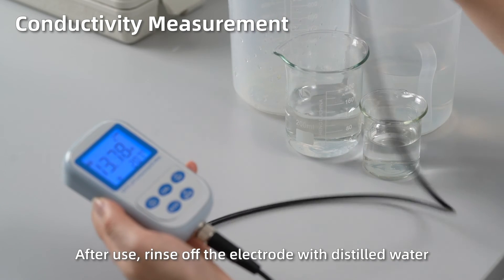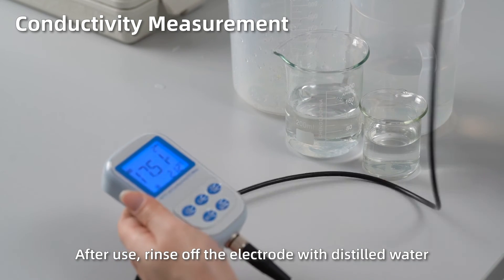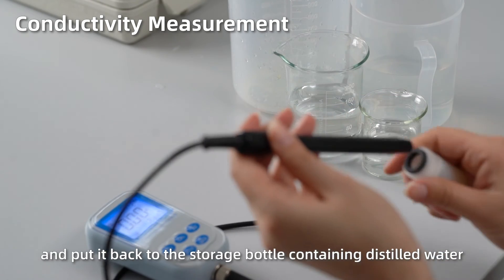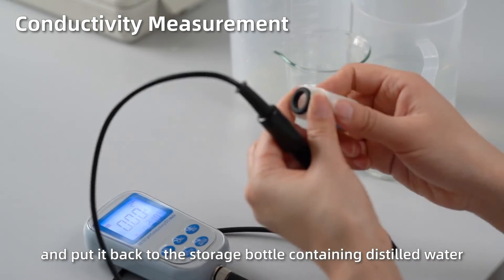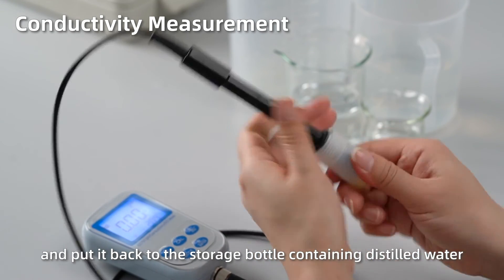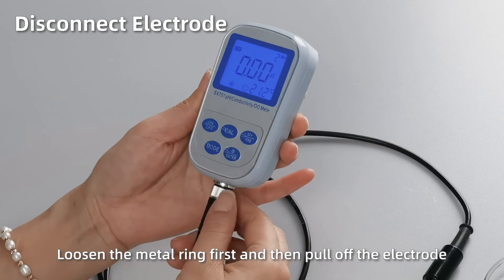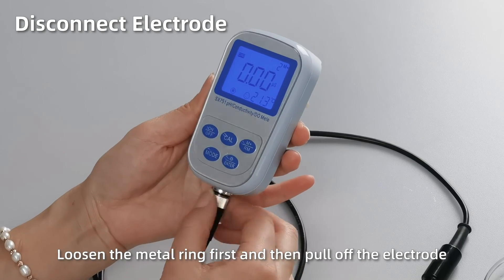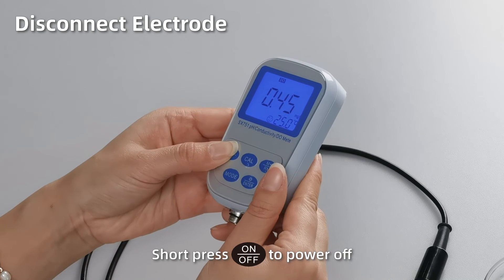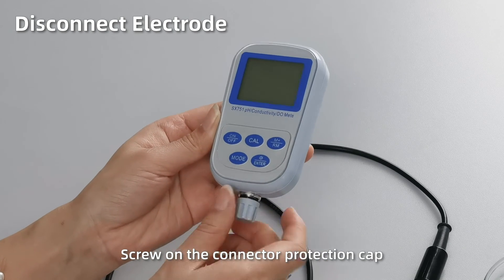After use, rinse off the electrode with distilled water and put it back to the storage bottle containing distilled water. Disconnect electrode: loosen the metal ring first and then pull off the electrode. Short press off to power off. Screw on the connector protection cap.